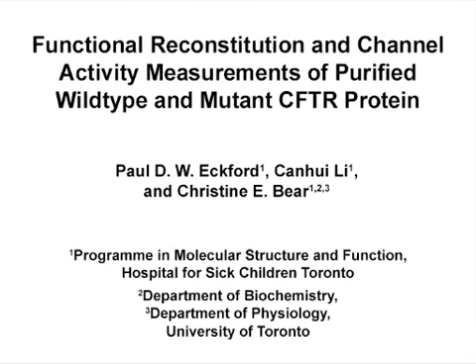The overall goal of this procedure is to measure the function of a population of CFTR channels in a reconstituted system, and to examine the response of the channels to the presence of modulator molecules.